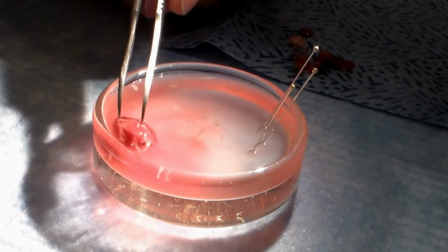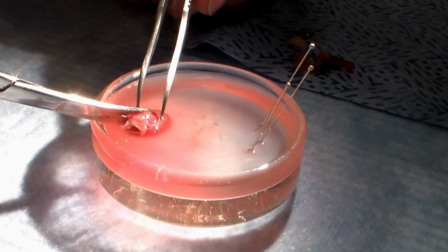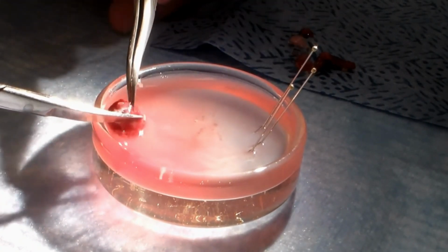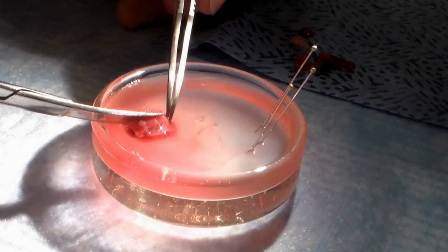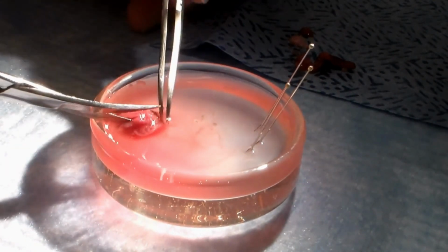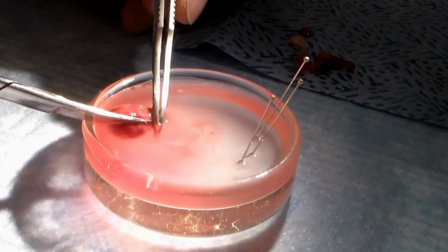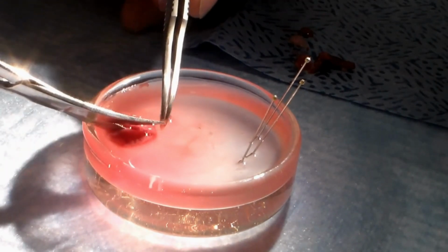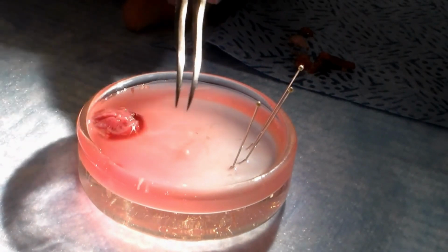So once the right ventricular free wall has been removed, what remains is the septum and the left ventricular free wall. But now with being able to visualize the septum easily, we can cut directly down the septum from the base to the apex. And with that cut made, the left ventricle is now prepared and ready to be sliced into the cardiac slices.